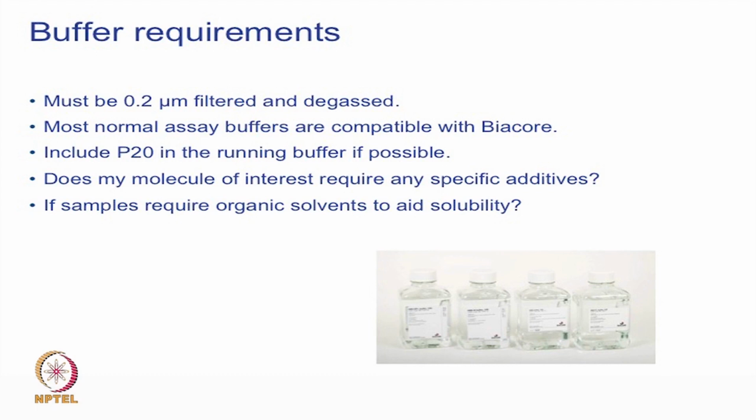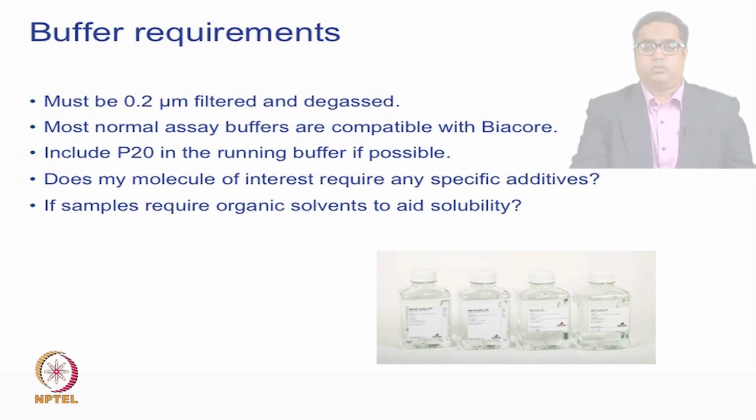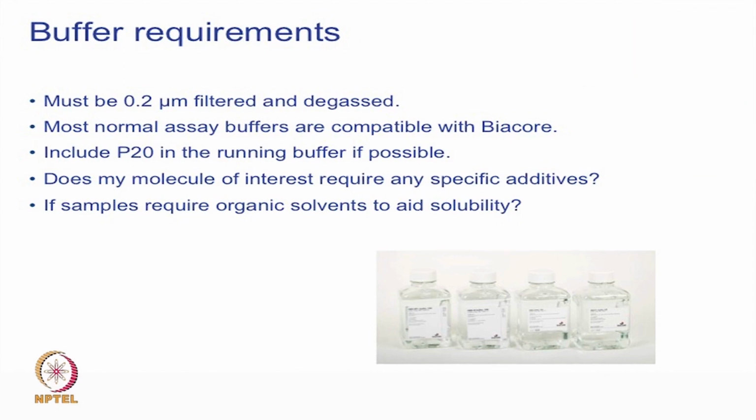Sometimes some additives are especially required for your running buffer, like metal ions or other activating molecules, activators. All these need to be added into your running buffer or sample buffer to maintain the conditions for your experimentation. And when we filter and degas, we need to check for proper filters which are compatible with water and organic solvents.